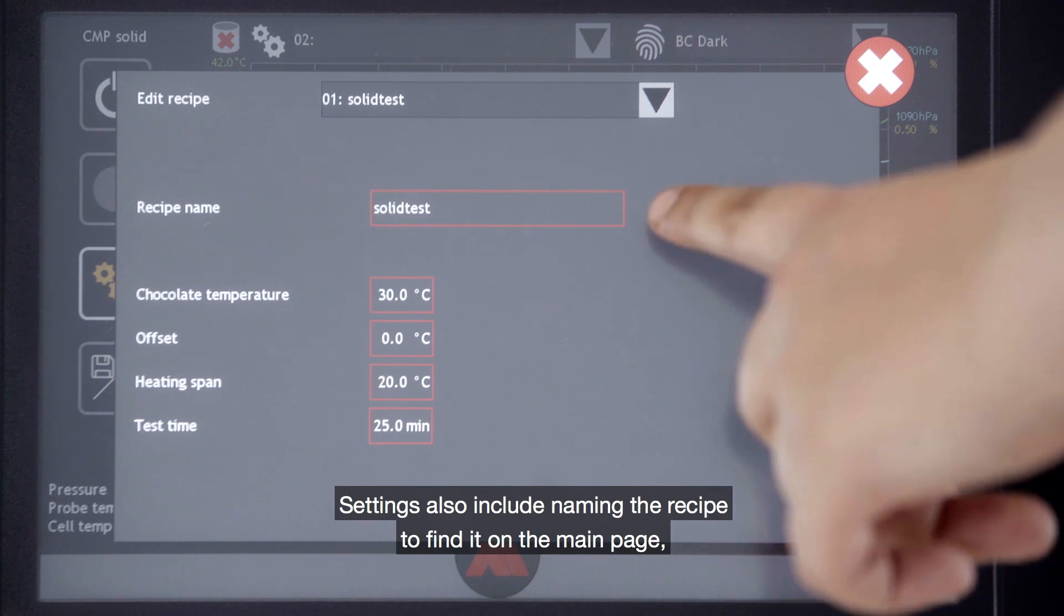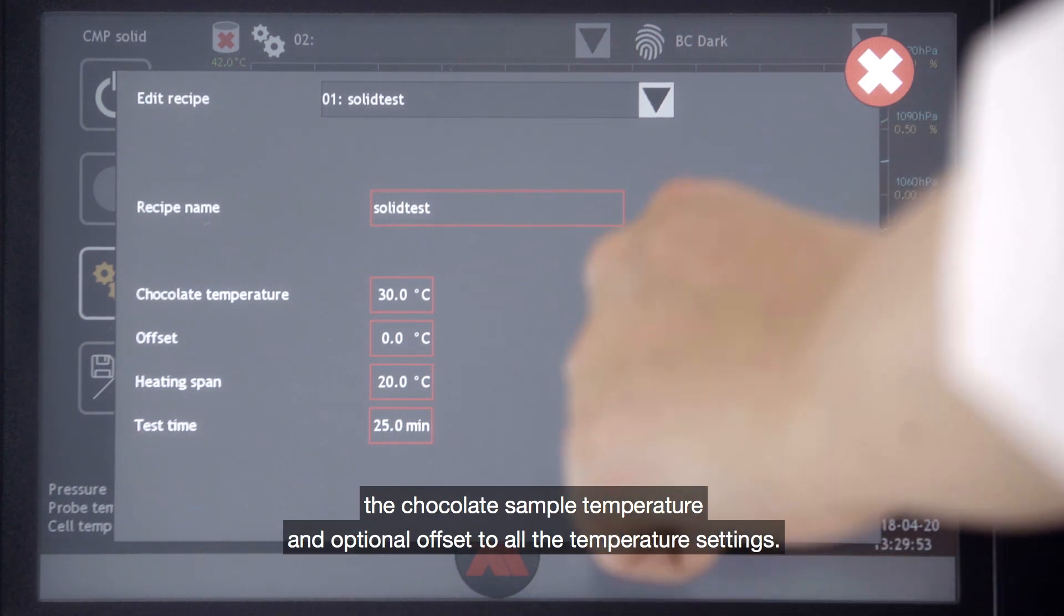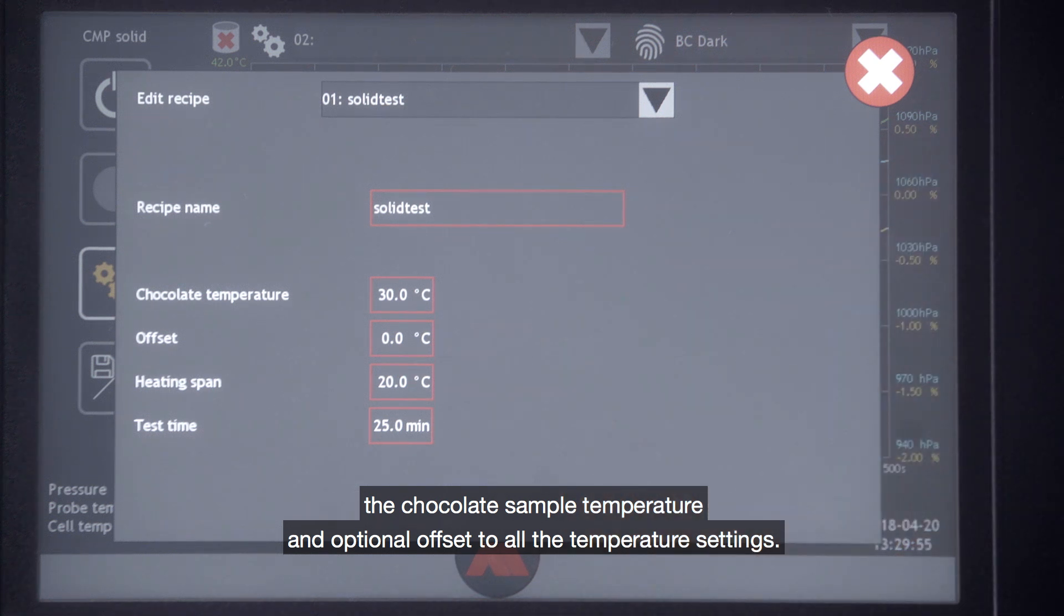Settings also include naming the recipe to find it on the main page, the chocolate sample temperature, and the optional offset to all temperatures.